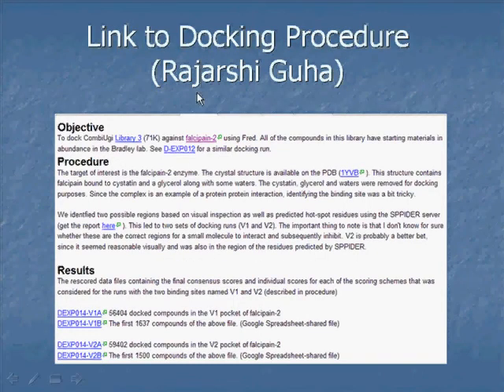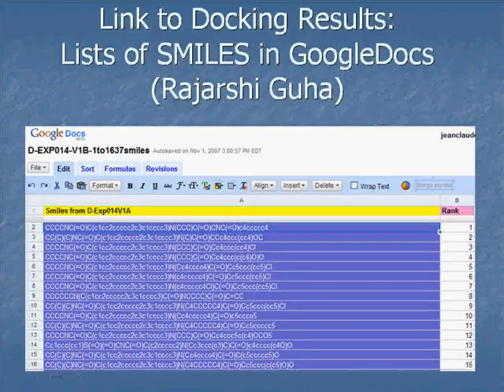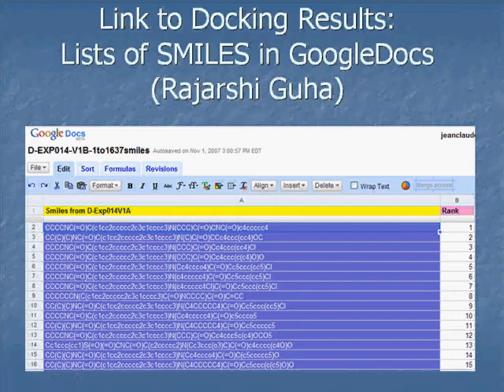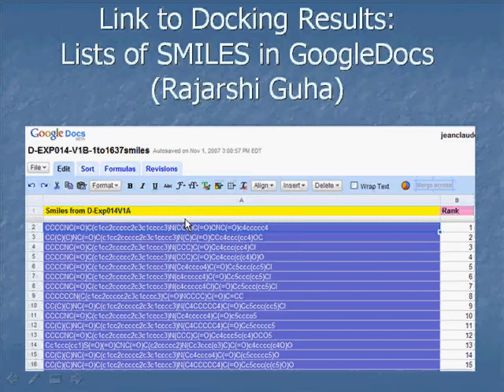We also link to the docking procedure that our collaborator Rajarshi uses. The idea is that this is replicable — someone who has done docking before should be able to get enough information from this page to generate the same compounds in the same order. These are called SMILES codes, and they're convenient ways of representing molecular structures that you can just dump into spreadsheets. But again, this is all made explicit, so you don't have to ask the researcher for permission. You can just go and look at the results.